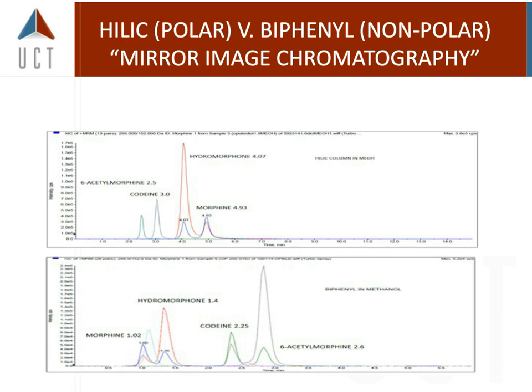So here again is one slide that someone had given me while we were putting this together, and it's important because when we're talking about two phases, polar and nonpolar is all there is. So essentially, if we use a HILIC column, which is more of a normal phase type, but it's a polar phase, HILIC is a silica. It also can be similar in a solid phase extraction cartridge, and we compare that to a nonpolar biphenyl phase.